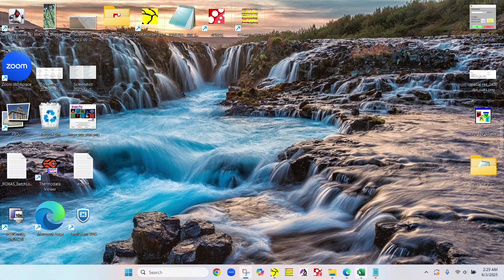So once you have all of that information, you will need two programs, not just ROXAS. One of the only downfalls of ROXAS at the moment, which they're working on, is that it has to be run with Image Pro Plus. This is an older version of Image Pro Plus, 6.0. I think it's up to like 7.0 now. And some people, like Matt, have a different version of it that's slightly different.